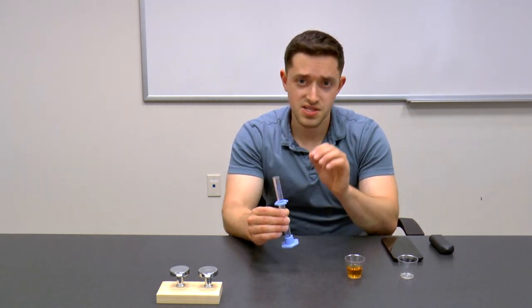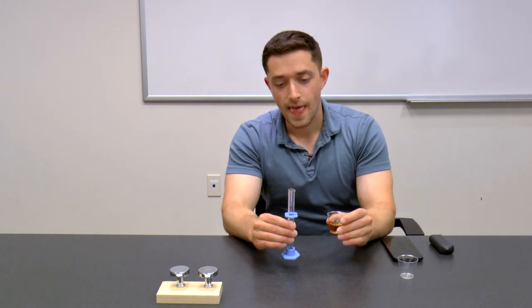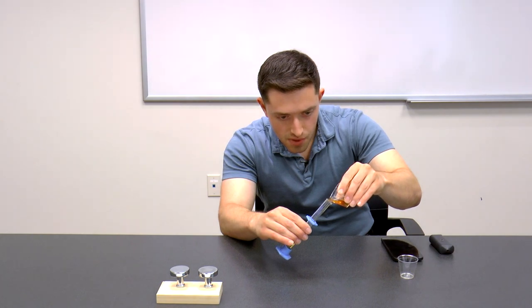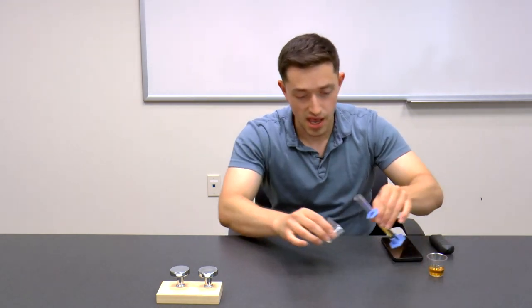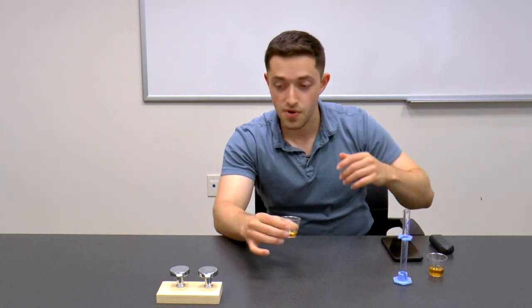Why five milliliters? It's our calibrated path length. Whenever you do reflection mode measurements, you need to calibrate for path length. I'll pour into my cylinder at a good angle — why? I want to reduce bubbles and foam as much as I can, because bubbles and foam are absolutely white and that will throw off your color measurement.